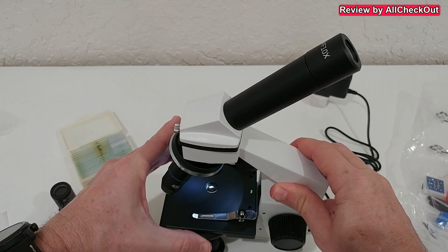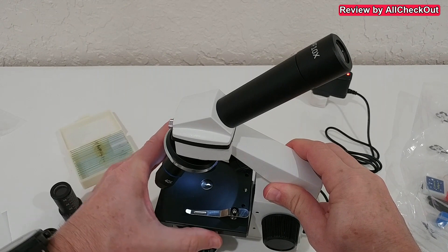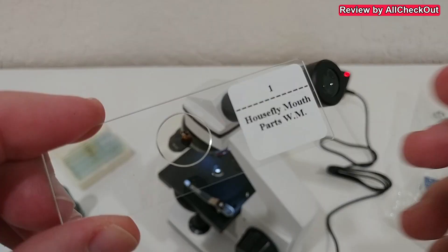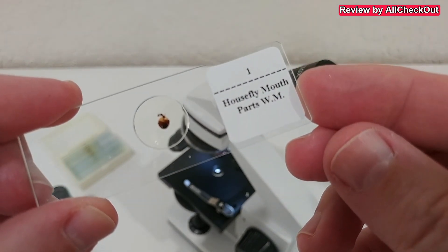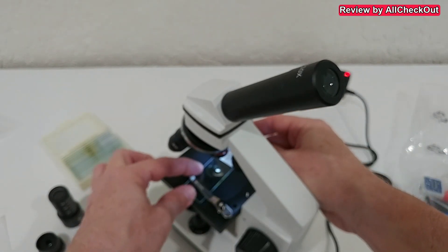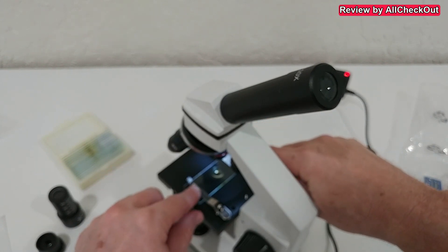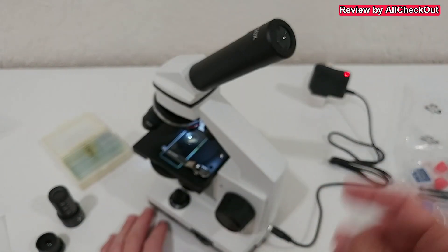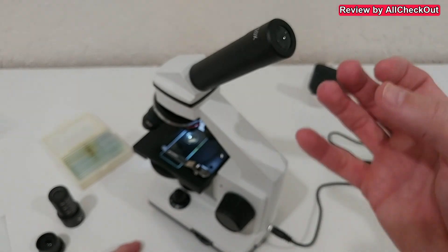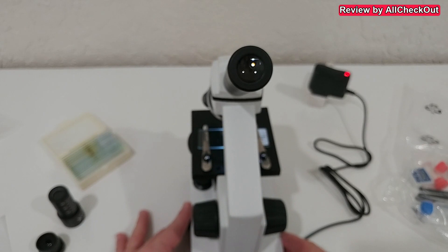With this wheel we can adjust the color filter — we have blue, green, yellow, purple, and neutral. I'm placing one of the pre-prepared slides underneath and aligning it in the center, making sure it's not moving, then securing it with the clamps. Now we can look into the eyepiece and slowly lift up the stage until we have a clear focus. I've already done this and it is absolutely awesome.